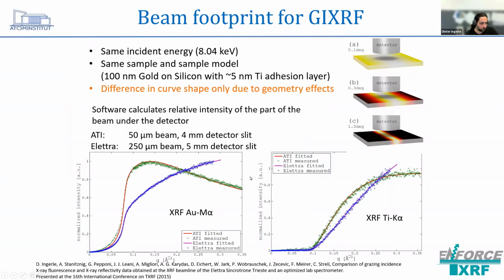So this is actually the fluorescence beam, and maybe I should mention this was measured with the vacuum chamber, which was basically provided by IEA there, which is quite similar to this chamber, which is also at Soleil and at the BTB beamline at BESSY. Anyway, it's a relatively large beam.